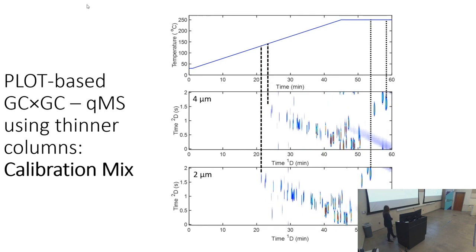And further, I also have the calibration megamix. So this has a lot of chlorinated and brominated analytes in it. And it's also performing pretty much the same way, but we're still having this open space in the beginning.